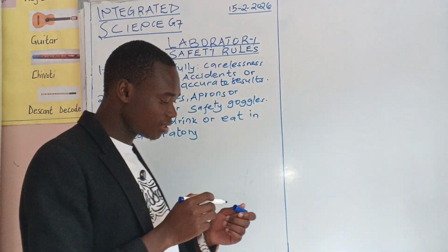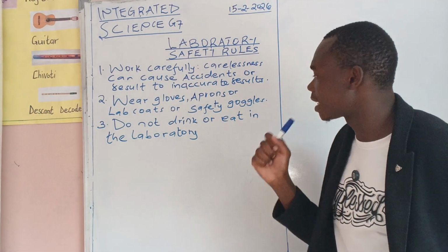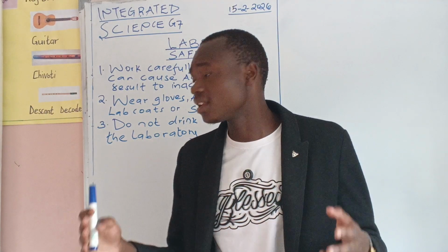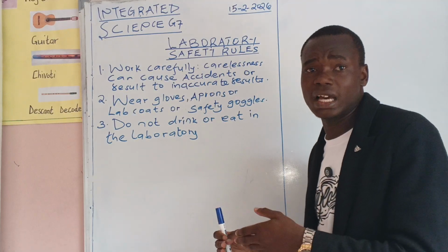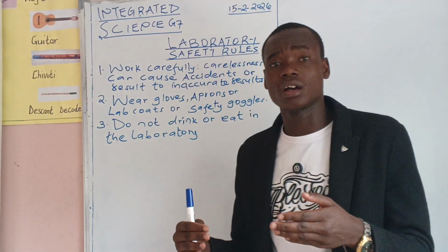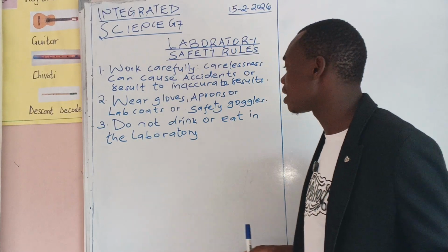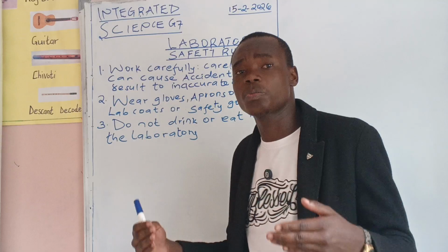Wow, another important safety laboratory rule: do not drink or eat in the laboratory. There are some students, some learners. It is laboratory time. You have been taken by your teacher to the lab, and your teacher has instructed you that today we are going to do an experiment.